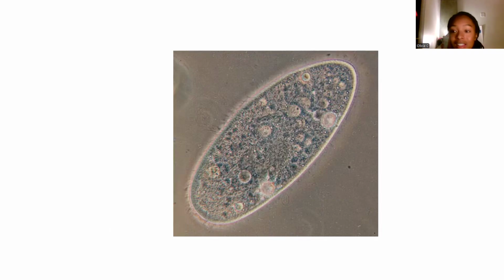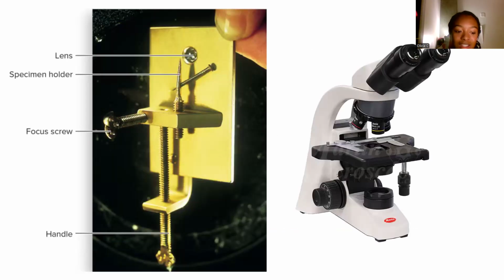Working with the microscope in the lab, I actually went through all of these things this past afternoon. This is a paramecium floating around in algae, which I probably wouldn't have seen if I wasn't curious about it being there and if I didn't persevere through not being able to see through the ocular lens for a couple minutes. And I guess something to end this off on, I wonder what power objective that Leeuwenhoek's microscope was in. Because if he was only seeing things in like a 4x objective, he wasn't seeing any microbes any smaller than 10 micrometers or animalcules. So I think that's really interesting.